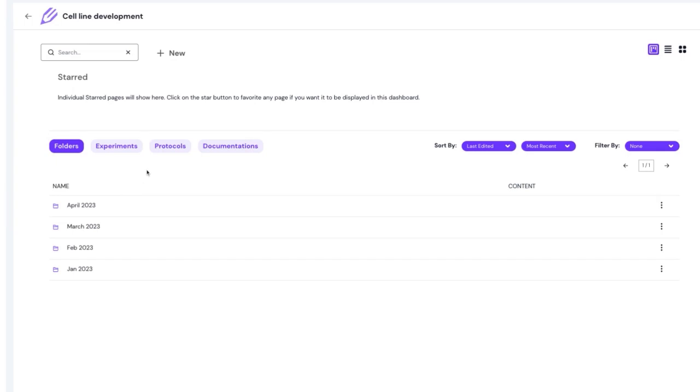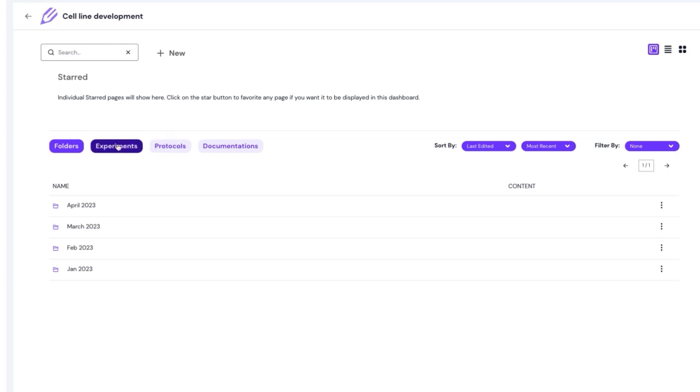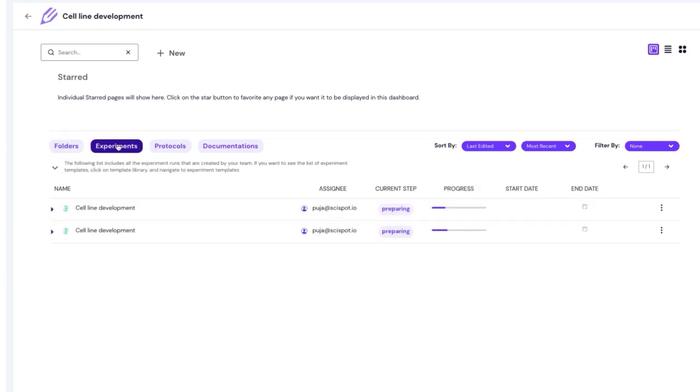Inside each Labspace, you can create separate folders, documents for SOPs, protocols, and experiments to bundle your protocols.